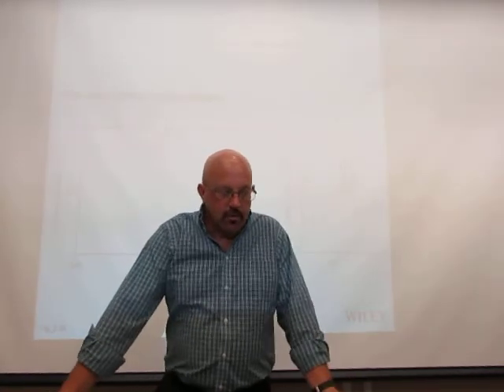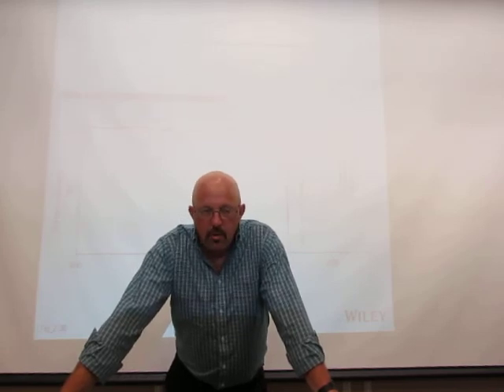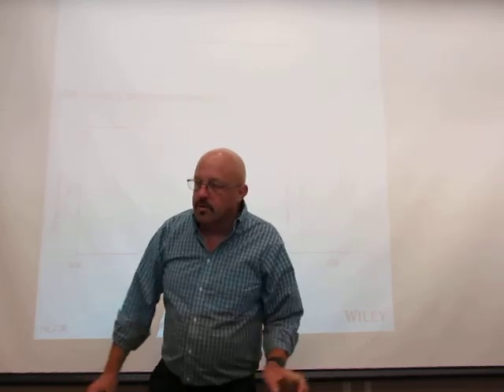Nitro groups show two different NO stretches. They have an asymmetric NO stretch and a symmetric NO stretch.